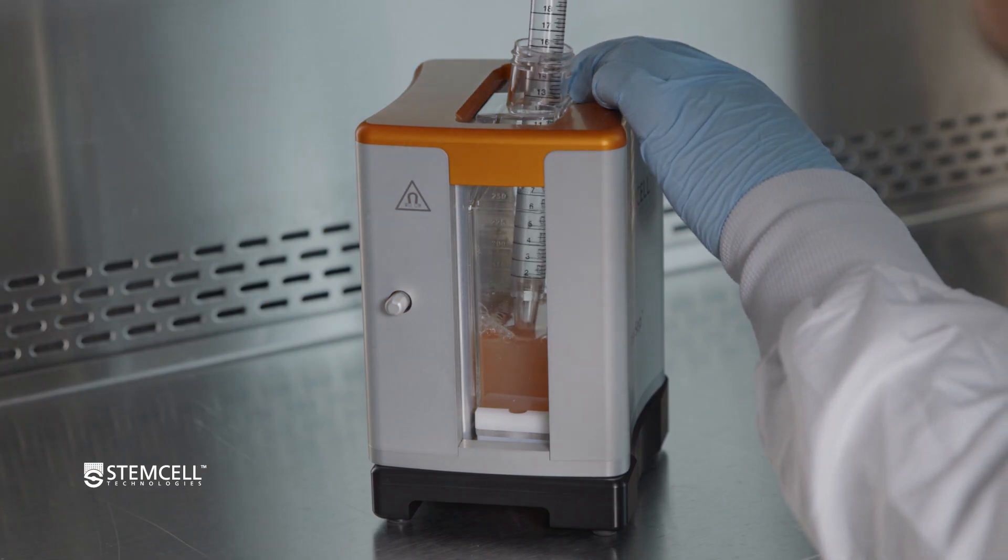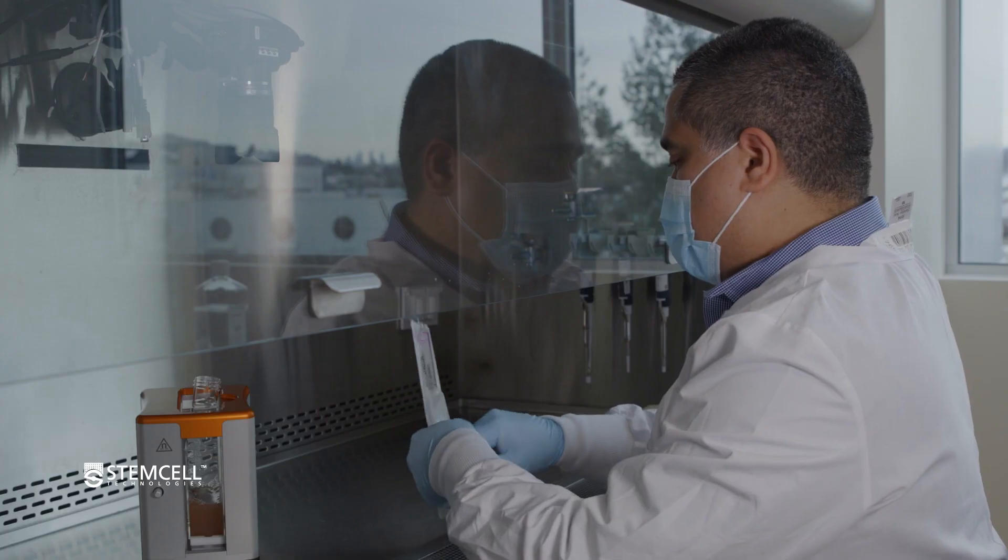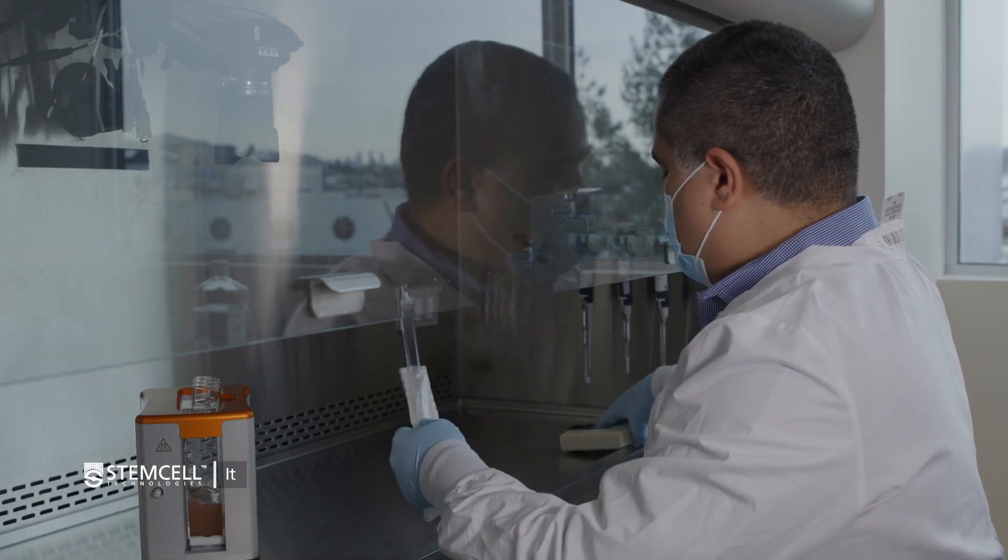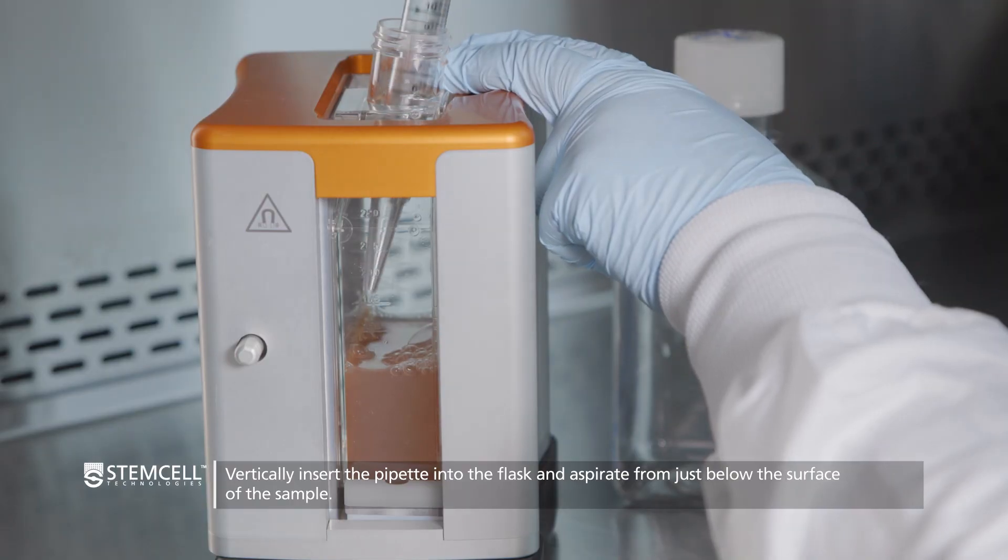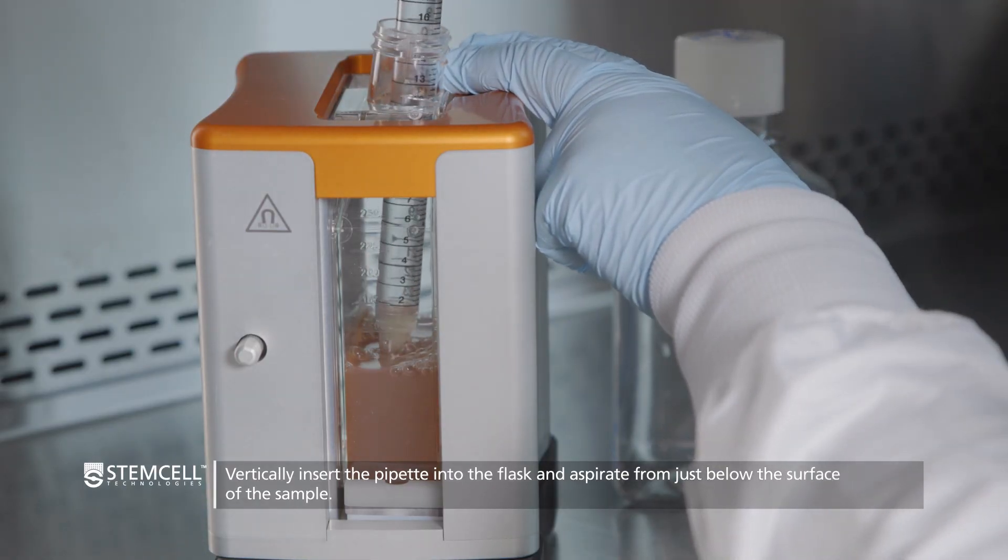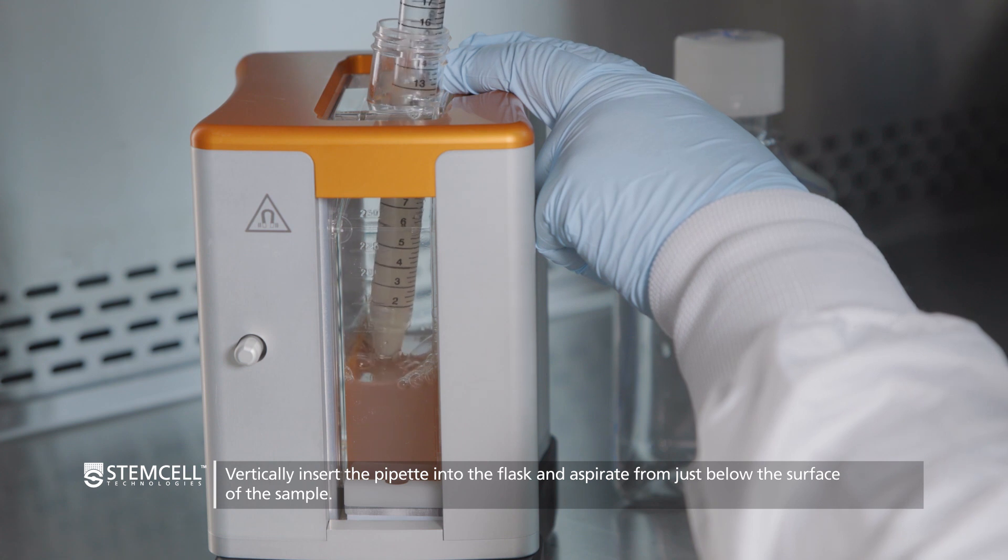Follow these steps to aspirate the supernatant out of the T75 flask while it sits in the magnet. To maximize the recovered volume, we recommend first aspirating with a 25ml pipette. Vertically insert the pipette into the flask and start to aspirate from just below the surface of the sample.